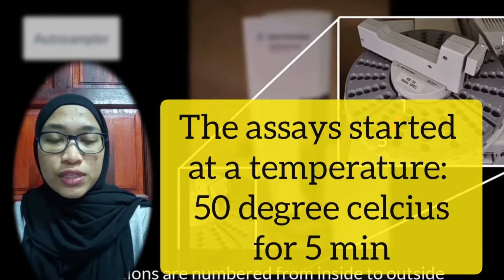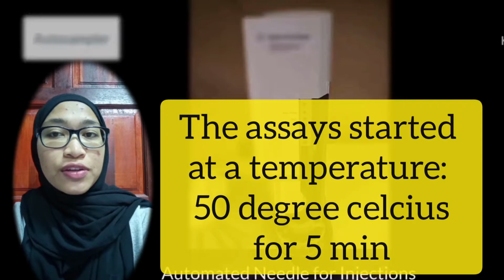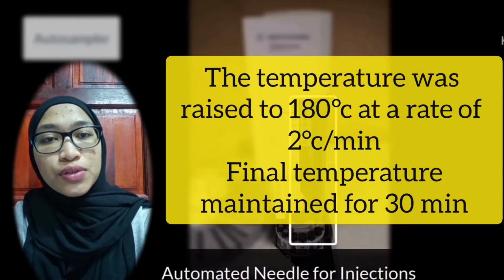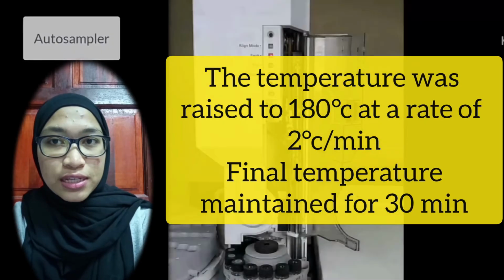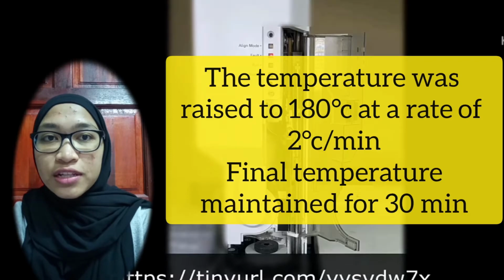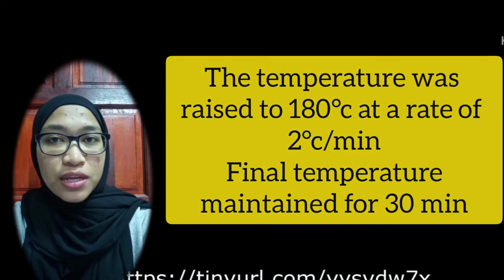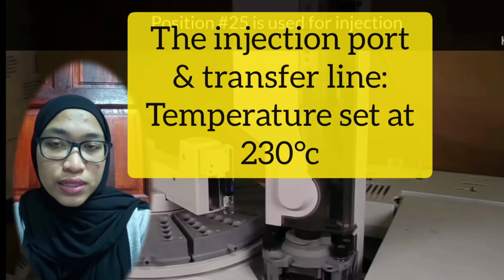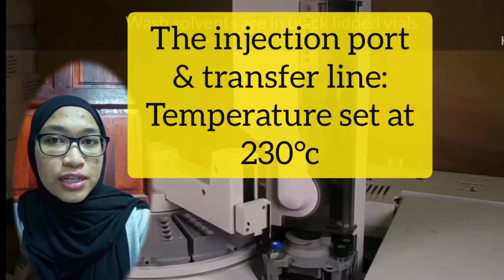The assays were started at a temperature of 50 degrees Celsius for 5 minutes. Afterwards, the temperature was raised to 180 degrees Celsius at a rate of 2 degrees Celsius per minute, and the final temperature was maintained for 30 minutes. The temperature of the injection port and transfer line was set at 230 degrees Celsius.